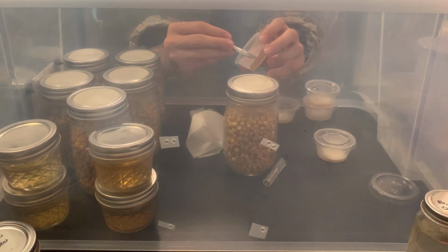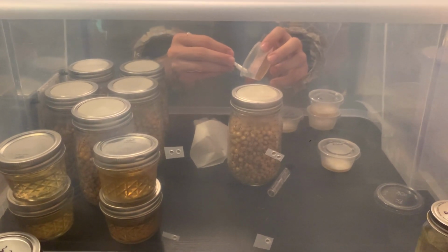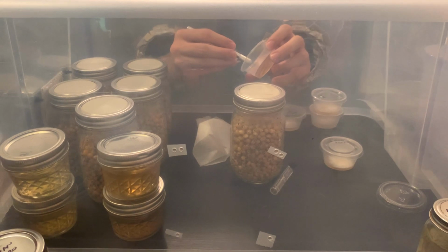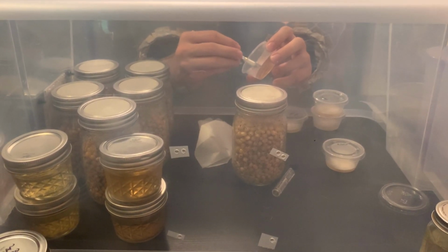I like to add, my dogs are still running around. I like to add a couple slices so that it's got agar growing from a couple different points.